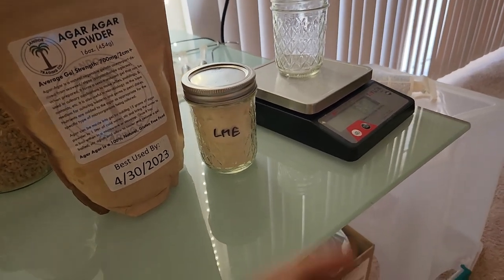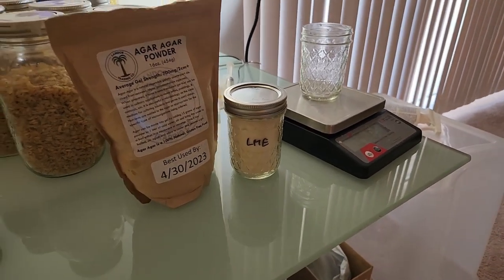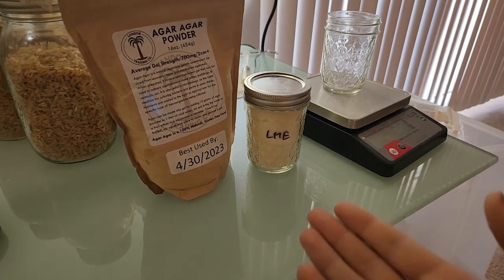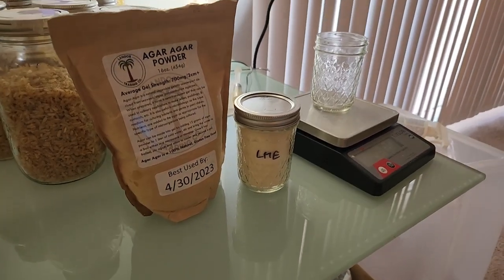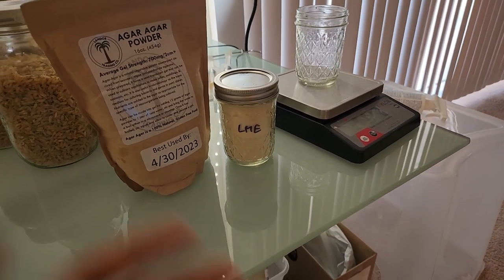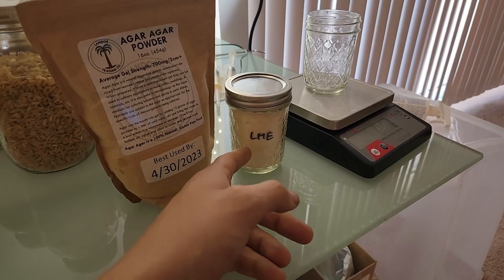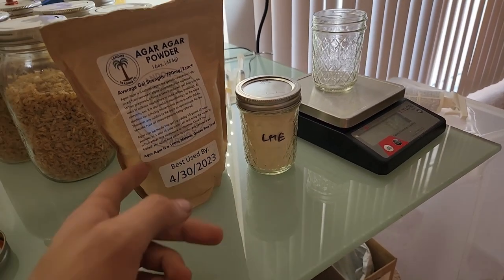What's up, guys? I'm mixing up some agar. I thought I'd show you how I do it. I use the FDA standard agar recipe for malt extract agar. Any other recipe is technically a modified recipe. What you're gonna need is light malt extract and agar.